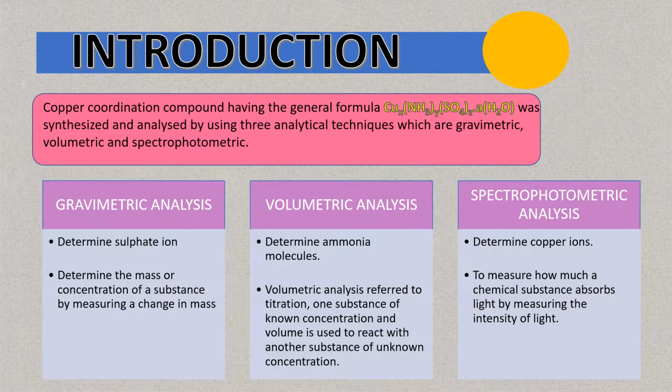My name is S. Yaallini. We will be conducting experiment 1, which is synthesis and analysis of copper coordination compound. In this experiment, a copper coordination compound having the general formula as follows was synthesized and analyzed using three analytical techniques, which are gravimetric, volumetric, and spectrophotometric.